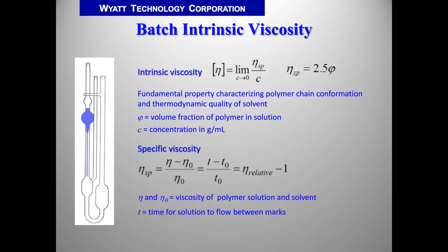Yeah, so we focus on the determination of intrinsic viscosity. Intrinsic viscosity is one of the fundamental properties of polymers that gives information about polymer chain conformation and interaction with the solvent. Intrinsic viscosity is calculated as specific viscosity divided by concentration at concentration approaching zero. Specific viscosity, according to Einstein, is directly proportional to the volume fraction of polymer in solution.